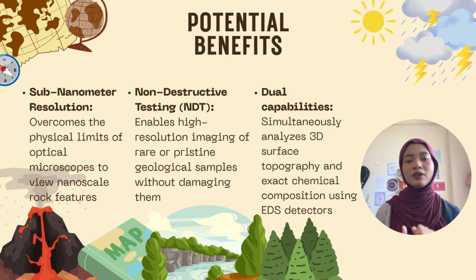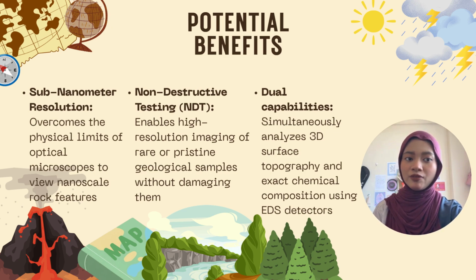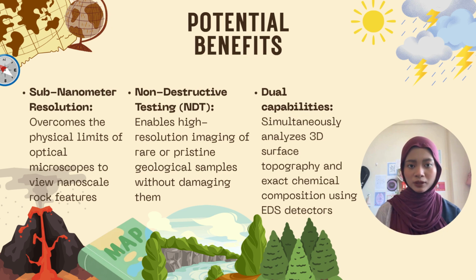Our second major benefit is its capacity for non-destructive testing, or what we call NDT. In earth science, we are frequently tasked with analyzing exceptionally rare, pristine, or entirely irreplaceable geological specimens. Think of lunar soil samples, meteorites, or deeply sourced mantle xenoliths brought up from deep within the Earth. We cannot afford to destroy them.